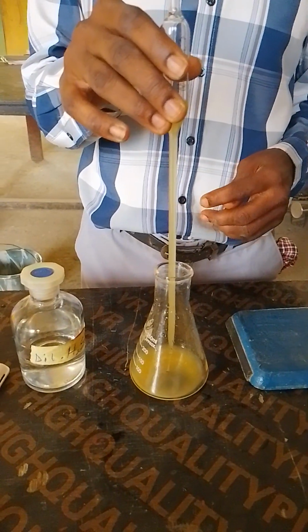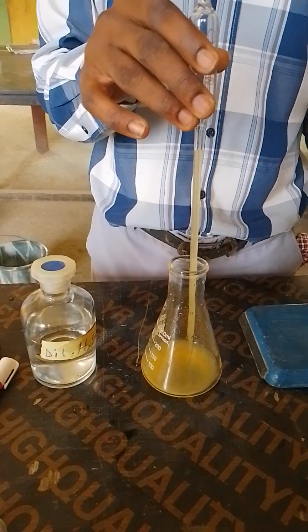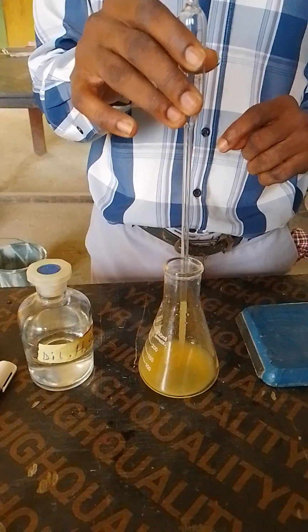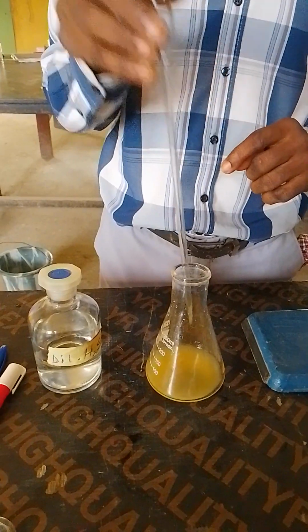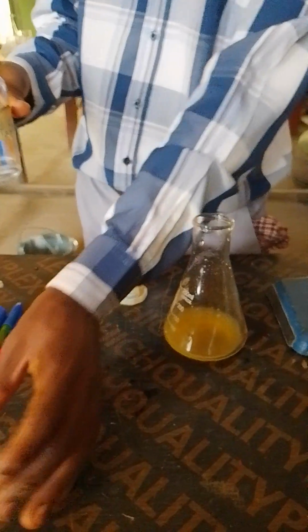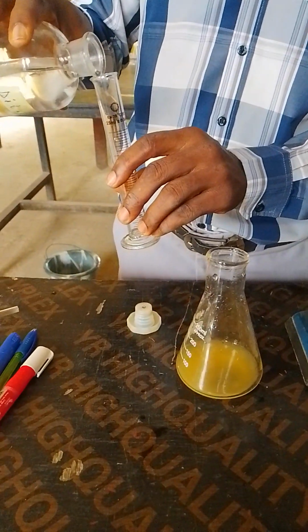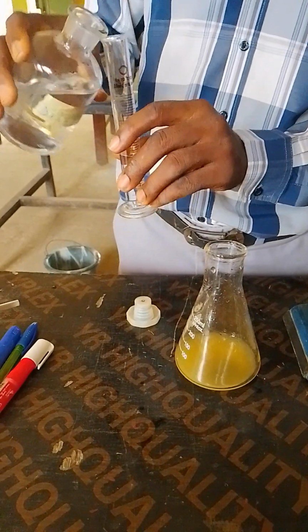Most redox reactions take place in acidic medium or alkaline medium, and whenever you are titrating with KMnO4, mostly it occurs in acidic medium. So the best acid to be used is your dilute H2SO4. So you bring your dilute acid, you measure the quantity. I'm going to use 10. Whatever measurement you use, it doesn't matter, it's still going to give you the same thing. You have only put your reaction in acidic medium.